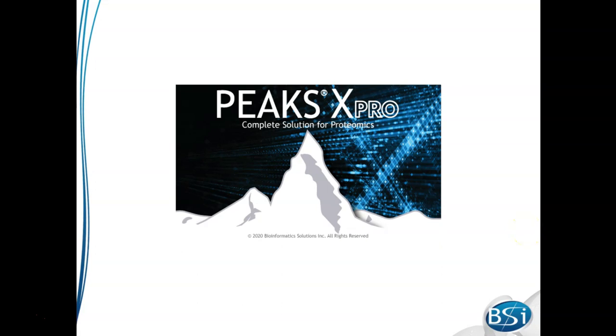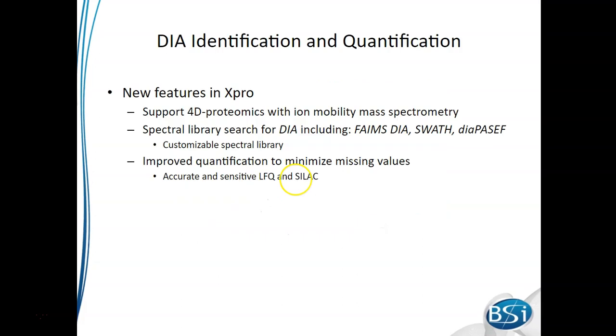Today I'm going to share with you the new DIA and ion mobility features in PeaksX Pro. We put a lot of work into supporting 4D proteomics. That means looking for peptides in the retention time dimension, M over Z dimension, intensity dimension, and also the ion mobility dimension.